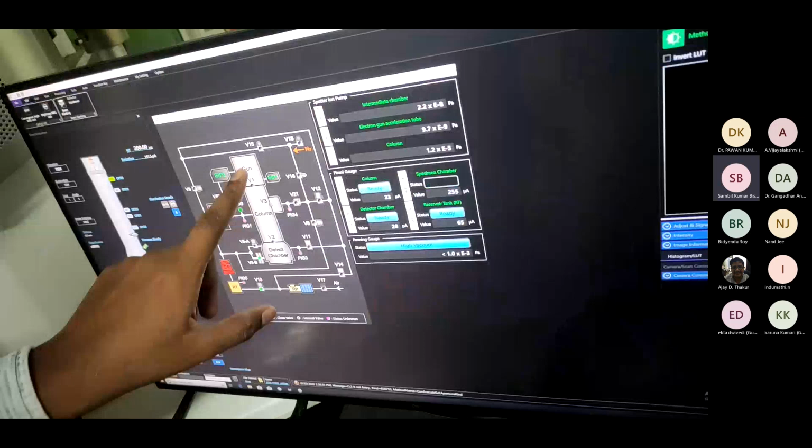And the gun chamber, they have a pressure. Here you can see. Okay. So now this is inside the specimen chamber. Okay. So right now I'm in the chamber. So I'm inserting it carefully.